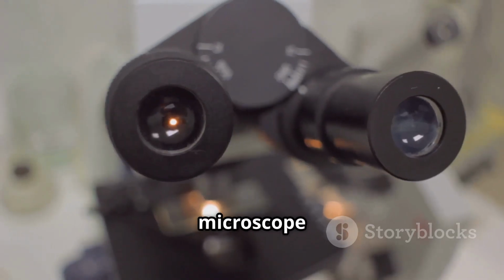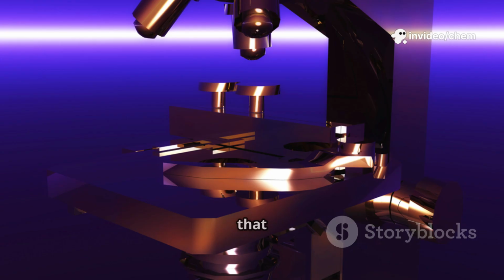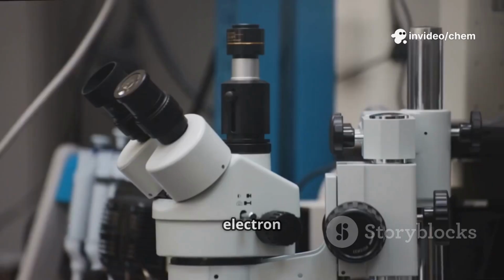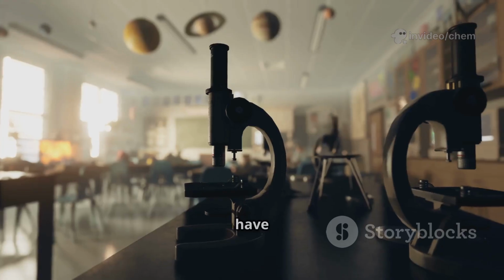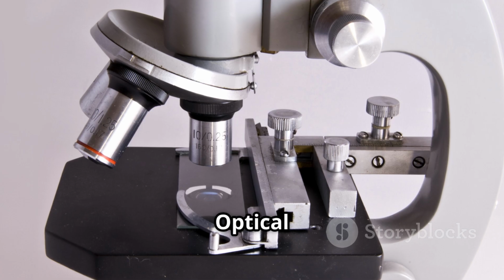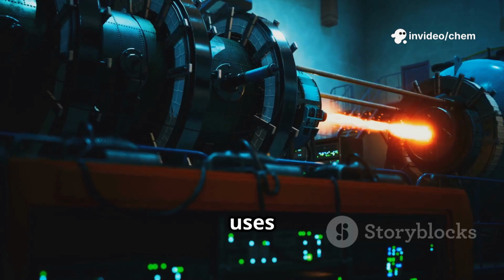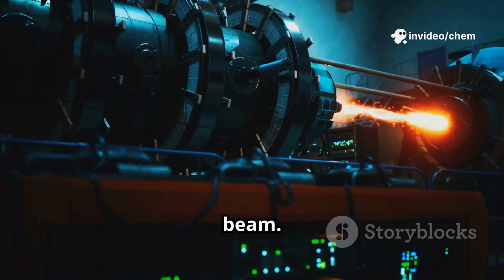Therefore, microscope can be divided into 2 categories on the basis of source to produce image, that is, optical or light microscope and electron microscope. These both have the same working principle, but the major difference is the source. Optical microscope uses visible light as a source, while electron microscope uses focused accelerated electrons beam.